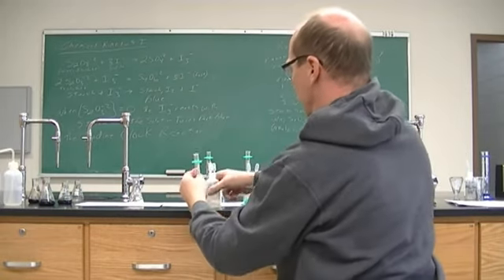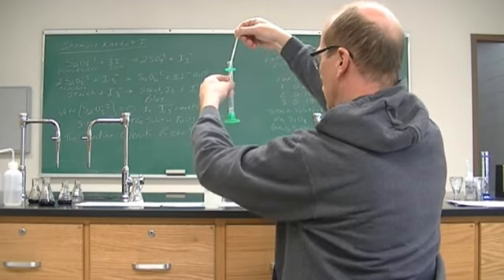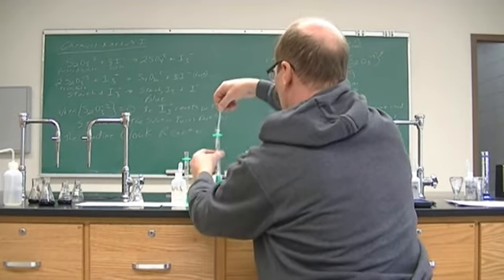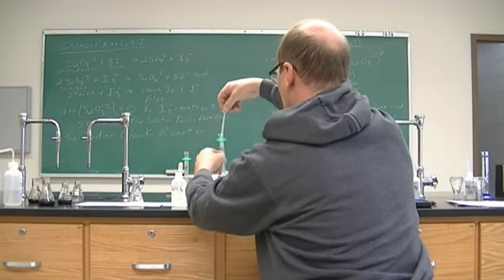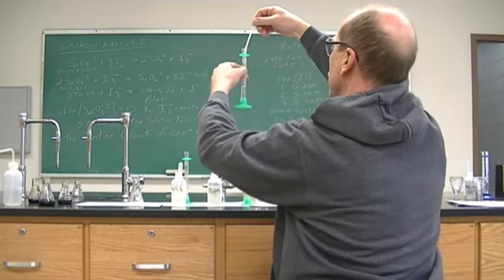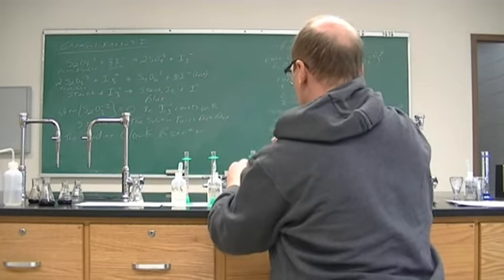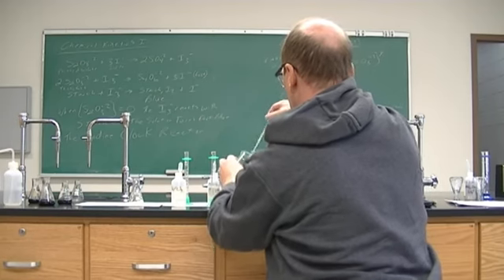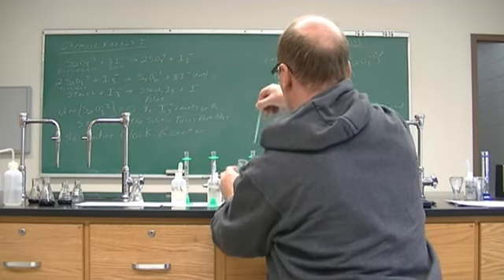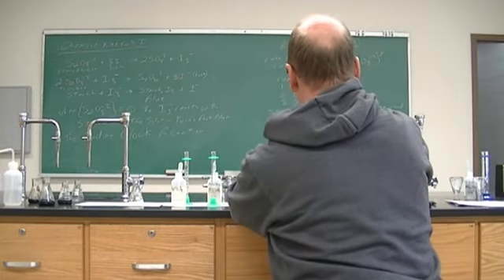3 mils of starch, 5 mils of the S2O3, 5 mils of the 0.1 molar KI, and 5 mils of the 0.1 molar S2O8.